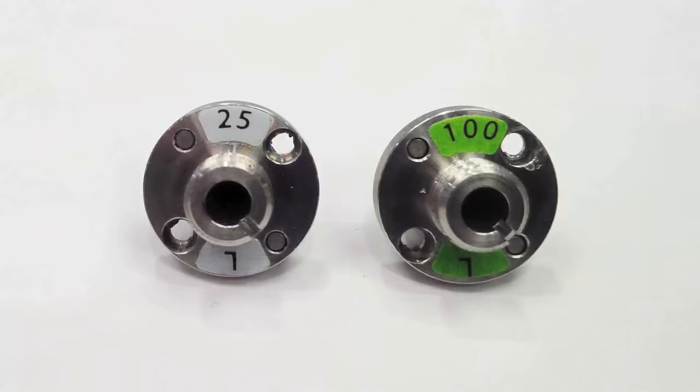With the set of interchangeable SMA connectors of varying slit sizes included in the fluorescence bundle, the Flame is even more versatile, allowing you to find the best balance between maximizing signal strength and high resolution.